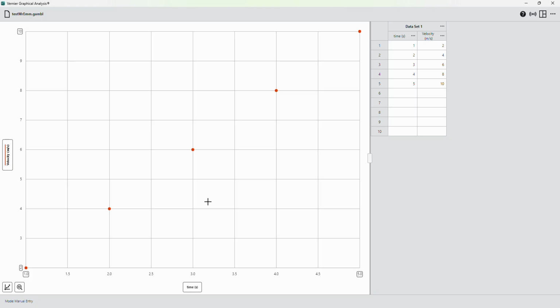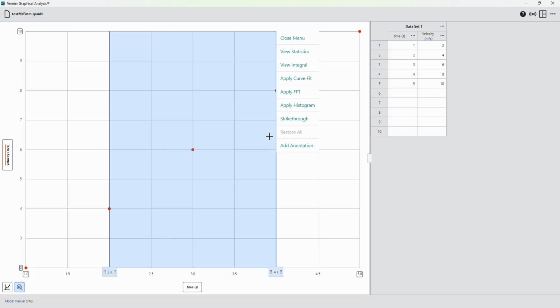So in that case, it could also calculate the integral, the area under the graph, which mathematically, sorry, maybe we're not familiar with it from calculus, the area under a graph is calculated with an integral, which is a concept that you will learn in calculus soon, hopefully. So that gave us the gradient, and that's something that you are doing all the time by choosing which data points you want, and then clicking apply curve fit.